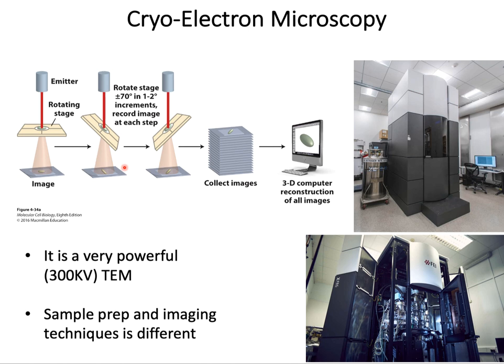Earlier, conventional TEM could be used to reconstruct 3D images, say of a cell, but it is extremely labor intensive. To do that, you have to serially section a cell embedded in a block, arrange each slice of the cell in order, top to bottom, then stain each section individually and take a static TEM micrograph of each of them, and then reconstruct a 3D image computationally, merging each individual image.